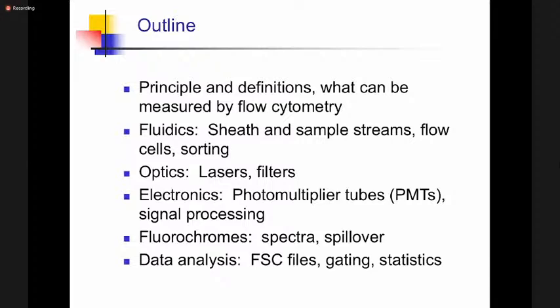I mentioned to you that the cell which you need to measure must be suspended in some fluid. So therefore, we'll be looking at what are the components of flow cytometry: the fluidic component, the optics component, which means that laser light being subjected to the cell of your target, and then there is capture of the signals which are released, hence the electronics.